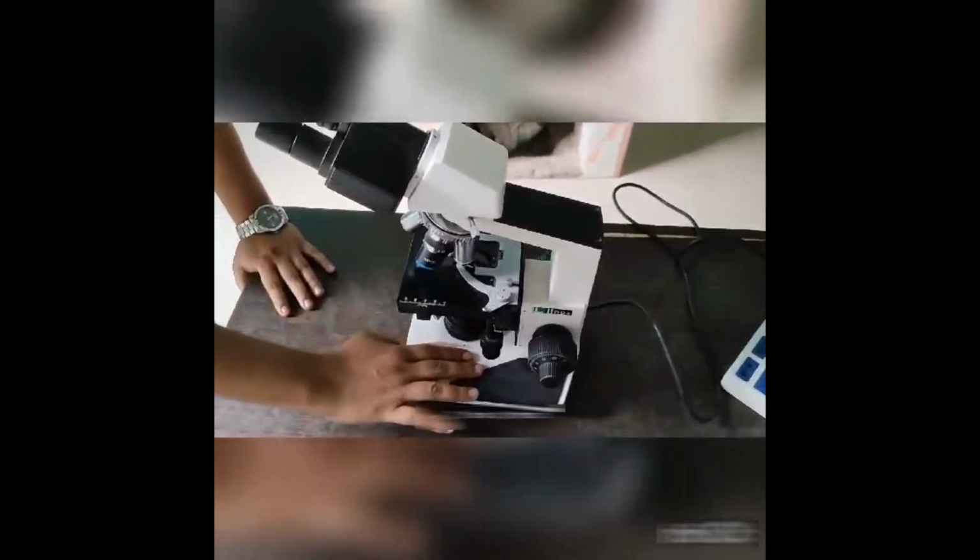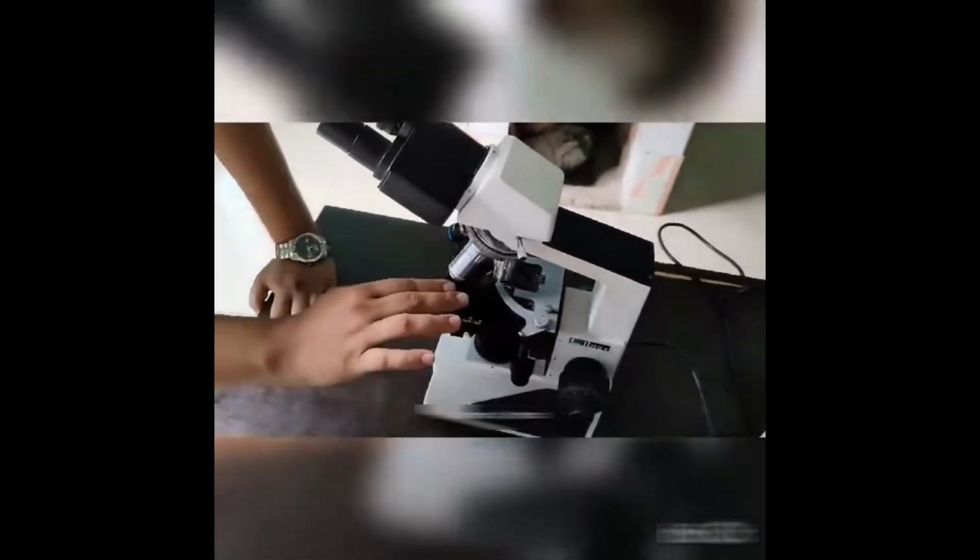So this is the base, and then the pillar, and this is the arm, and this is the eyepiece, and then this is the nosepiece. Three lenses: 10x, 40x, and oil immersion, which is 100x. And then this is the stage.